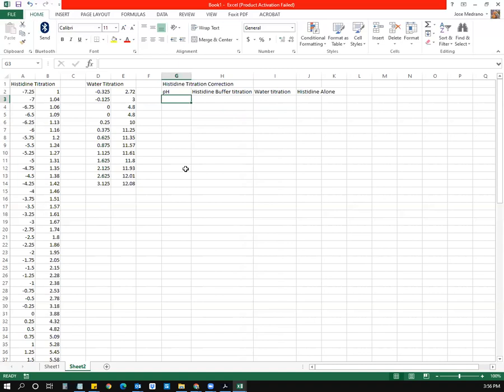So what we're going to do is, for every single one, we have to first make this pH 1 to 12.5. And like I've always said to everyone, let the Excel program do your work for you. You don't have to go down the entire line and type 1, 1.25, 1.5, 1.75, 2, 2.25, all the way until you get to 12.5. Chances are you're probably going to make a mistake, but if you at least focus your attention on the first 5 or 6, you can highlight this.